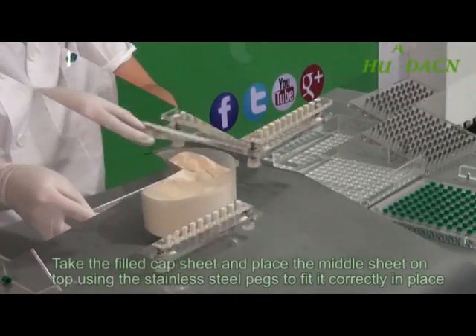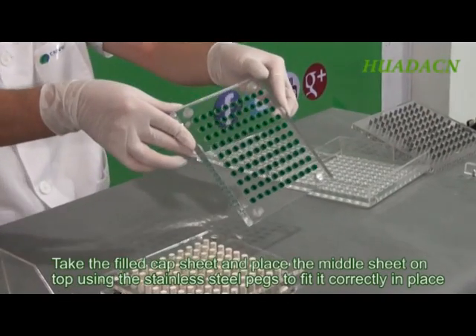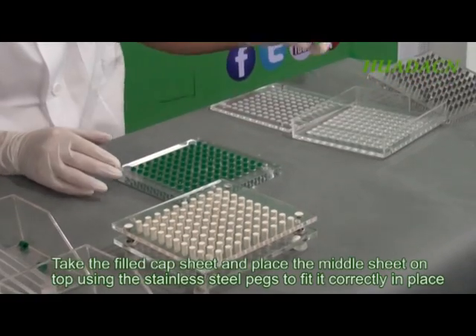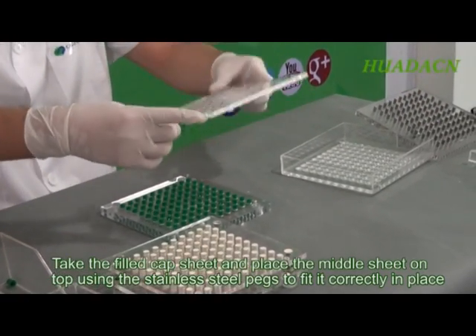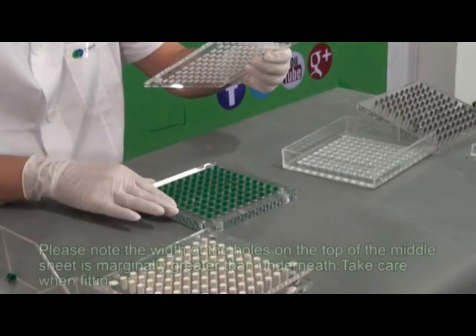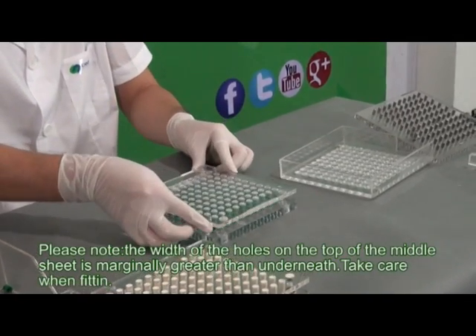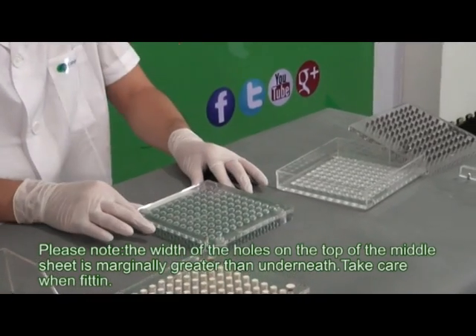Take the filled cap sheet and place the middle sheet on top, using the stainless steel pegs to fit it correctly into place. Please note: the width of the holes on the top of the middle sheet is marginally greater than underneath. Take care when fitting.